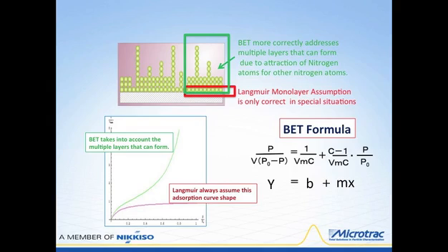Knowing the y-intercept and the slope of this line allows calculation of this value right here, which is used for calculation of the surface area.